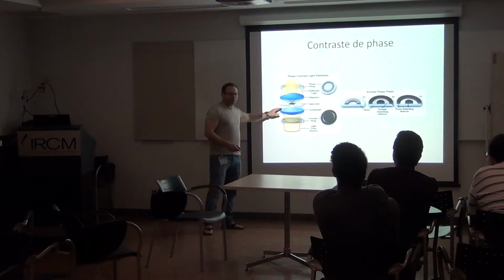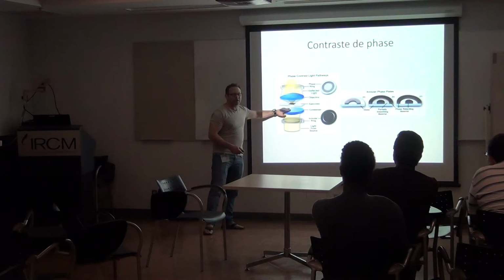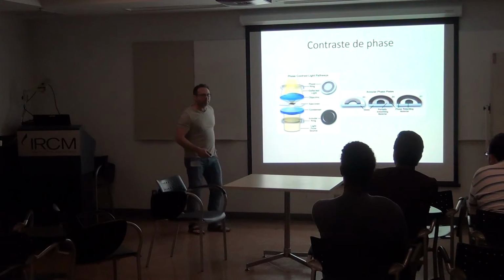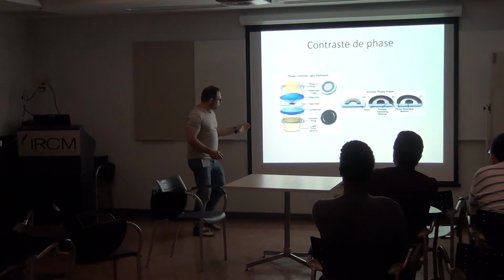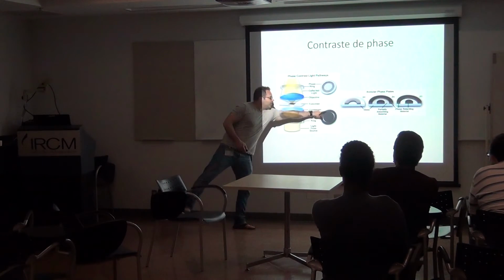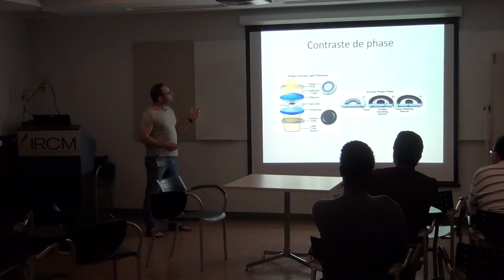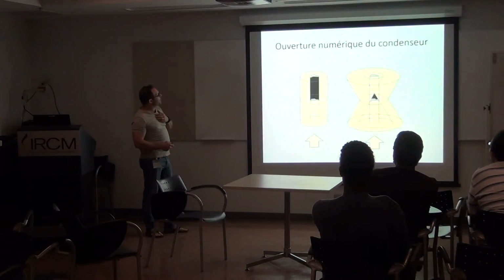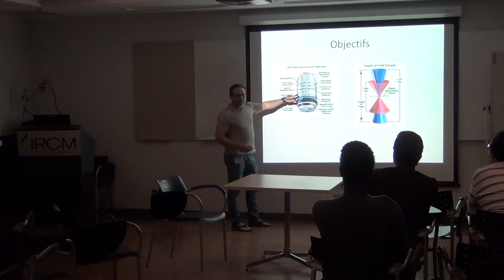Phase contrast will give you pretty good resolution. You won't see any dust located somewhere else, below or above your specimen. So you need a ring in the condenser system, like this, and you need an objective. And usually on the objective, as I said, the contrast method is written.